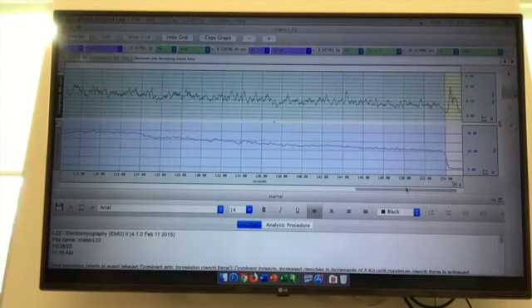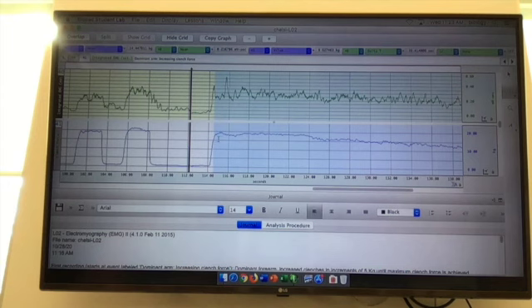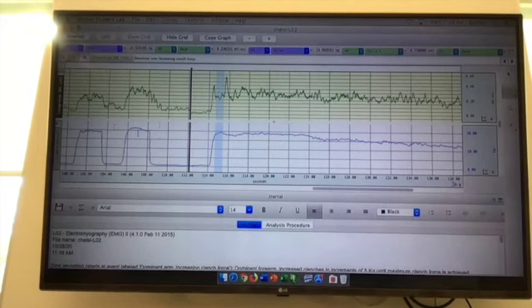Okay, so once you have the entire thing highlighted, you can get the total time that it took them to fatigue. That is going to be the delta T value right here. So that's the total time for the portion that you have highlighted. You'll also want to get the peak, the maximum strength. The maximum clench force you can just get by highlighting the first part of that grip strength exercise.